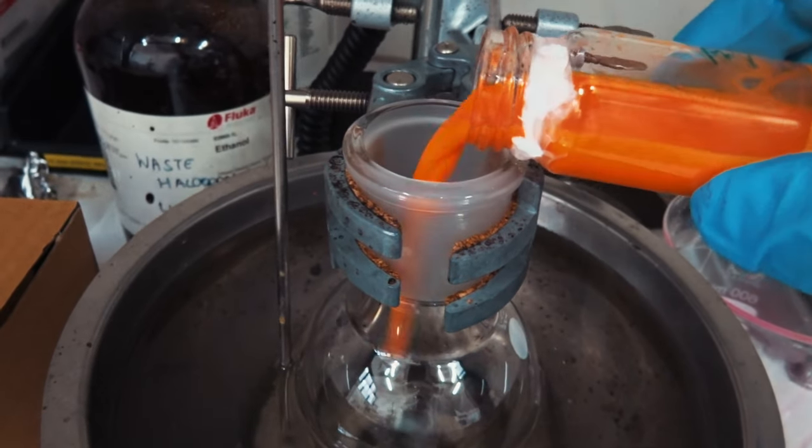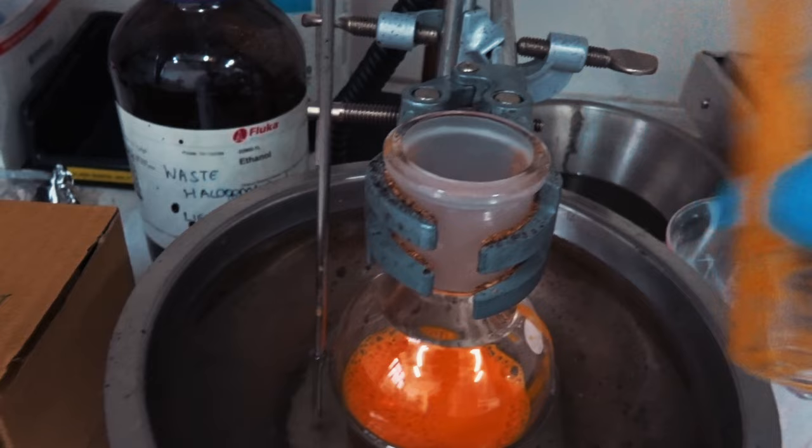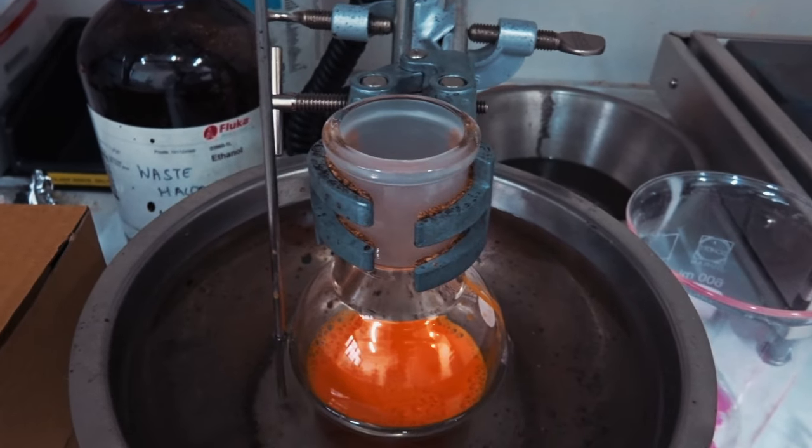We now have chloroform nano droplets in water. What I'm going to do now is put this on a hot plate and let the chloroform evaporate, and then you get nicely nanoparticles of your conjugated polymer in a water-based dispersion. Now that it's on the hot plate, I'm going to build a nice aluminum foil shield around it so that it's protected from light.